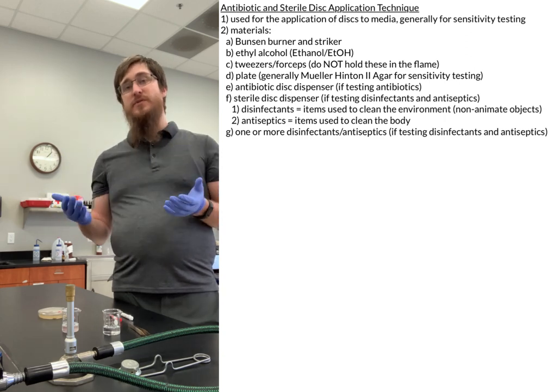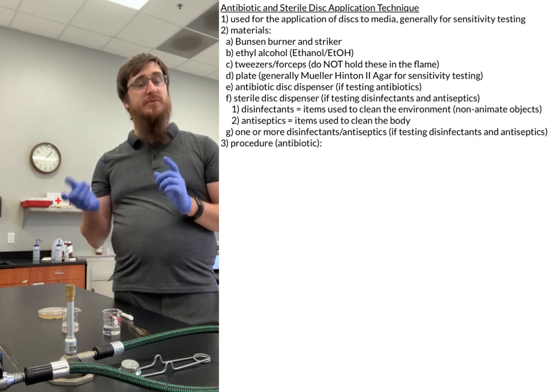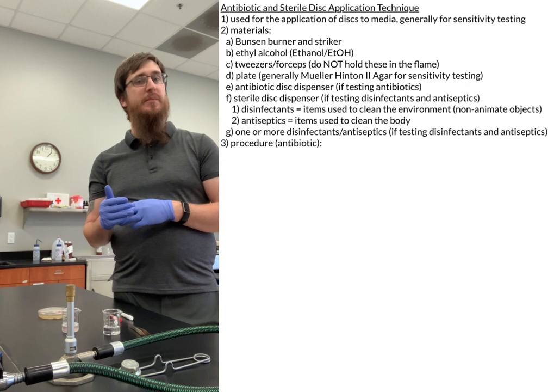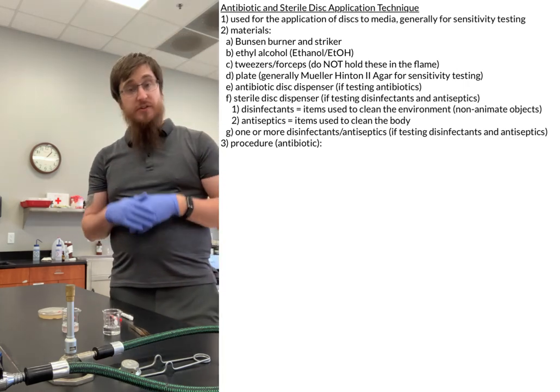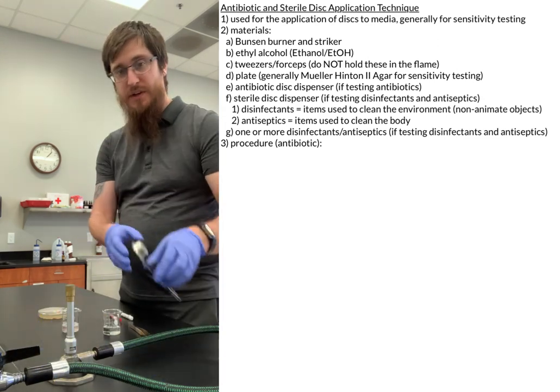So let's go ahead and run through the procedure and talk about the way that it works for both types of applications. It is very similar, there's just an extra step if you're doing a disinfectant or antiseptic. So let's go ahead and do a procedure. We'll start out with the antibiotic one. Let's go ahead and get our flame going.